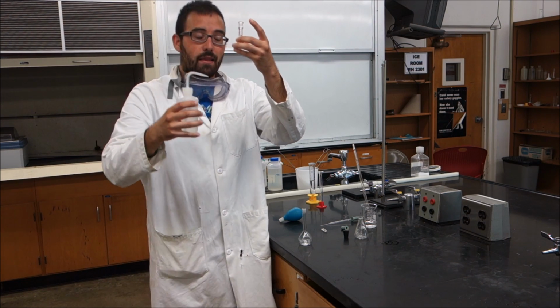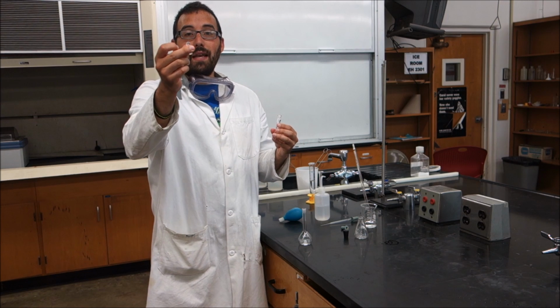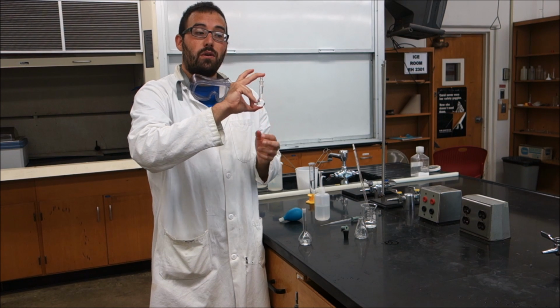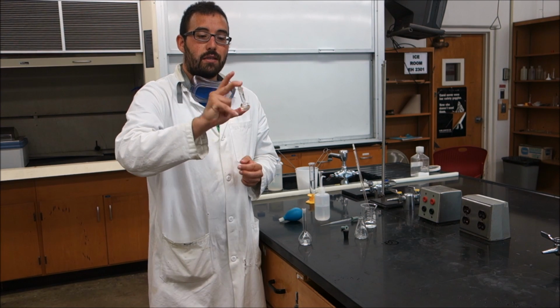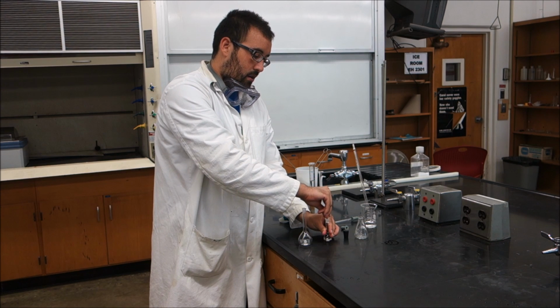And now I have it at the mark. We will then cap it with one of our penny head stoppers. So this little glass stopper right here, the penny head number 9. We'll cap it, we will hold it down tightly and invert it so we get a mix here, going up and down once or twice. And then we'll place it back down on our lab bench.